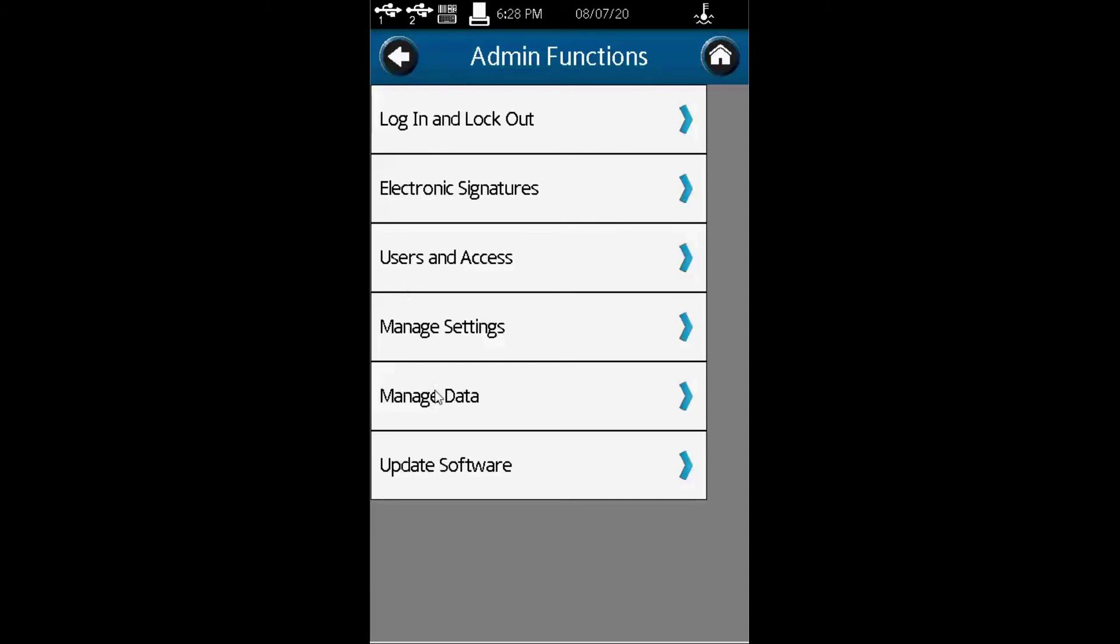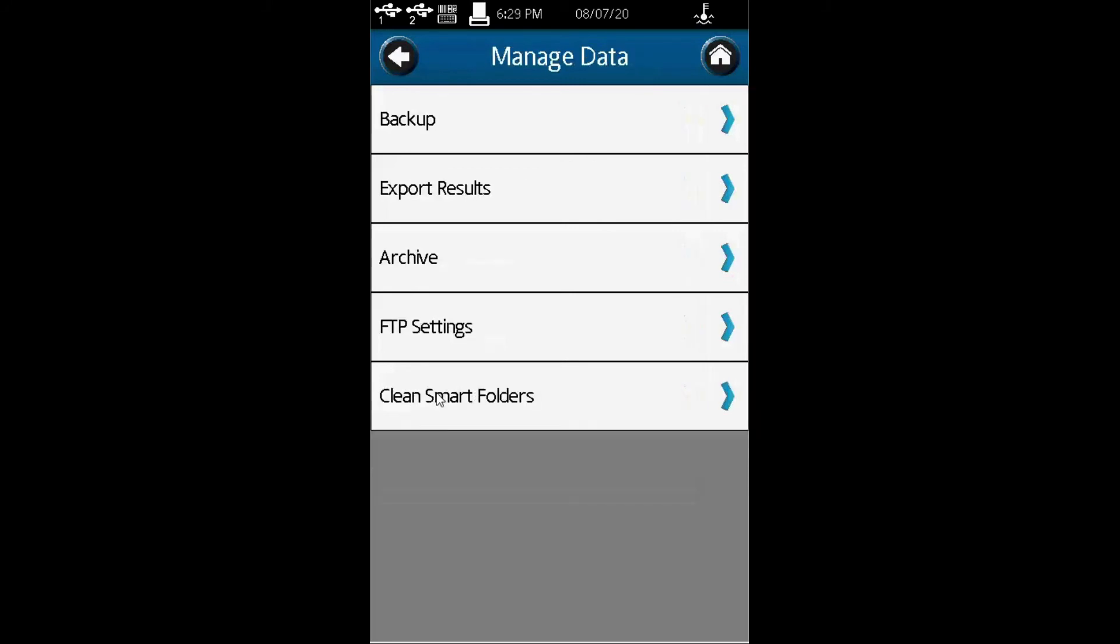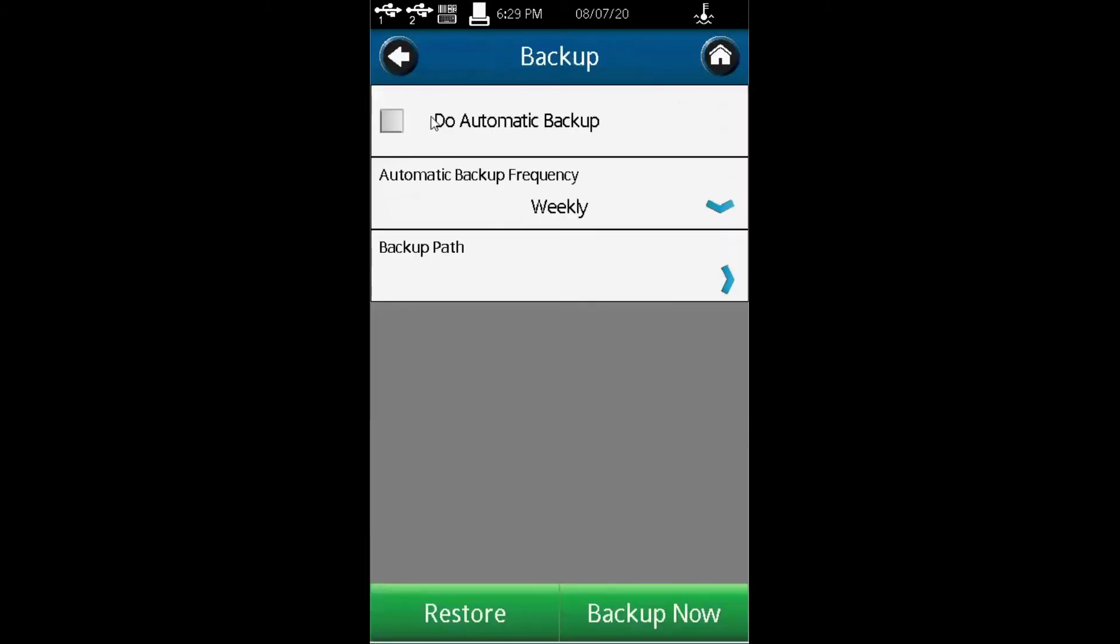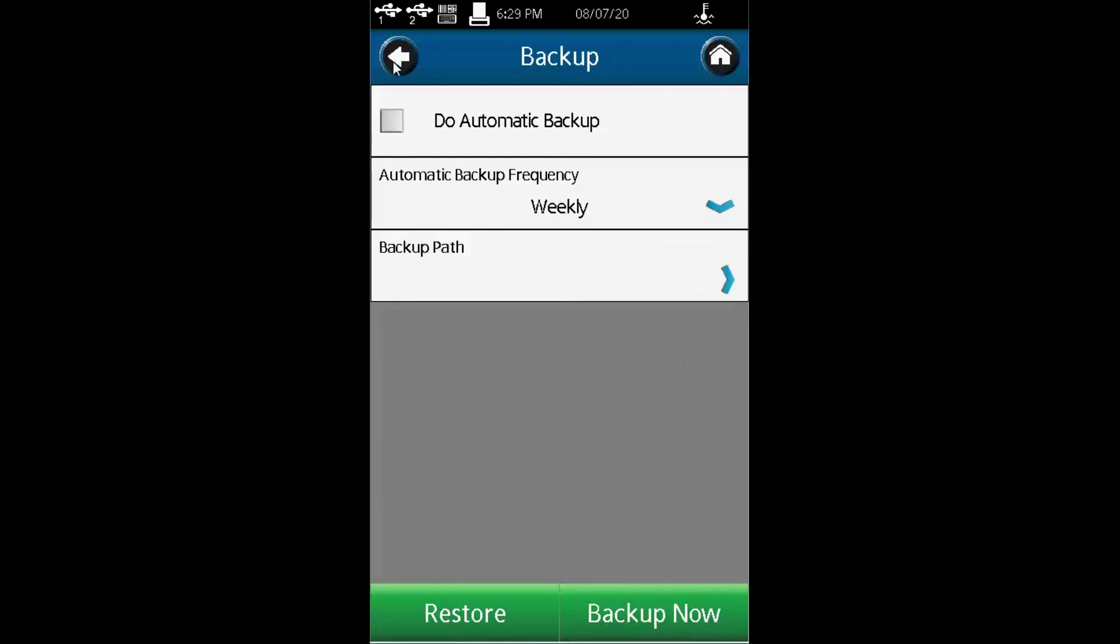Another thing of interest is manage data. Managing data is very important. For backup, you can set how often you need a backup. The frequency can be weekly or monthly. You can select what works for you.